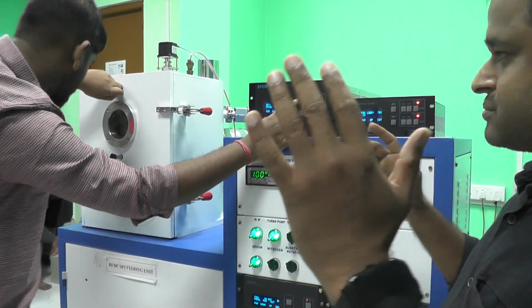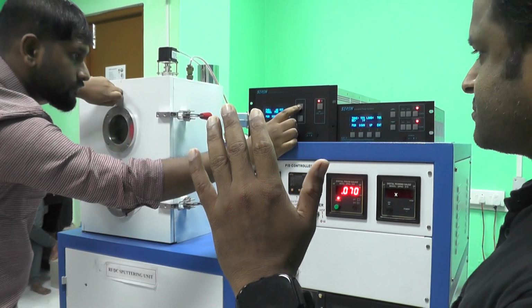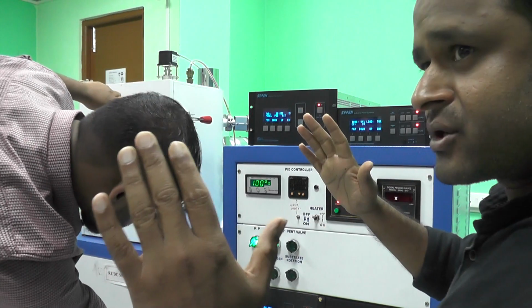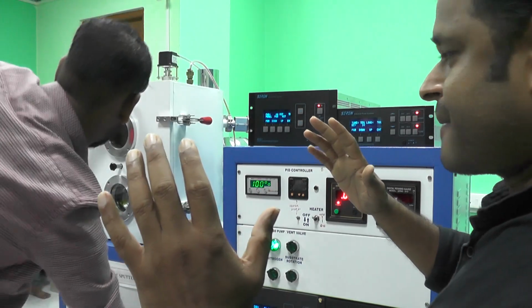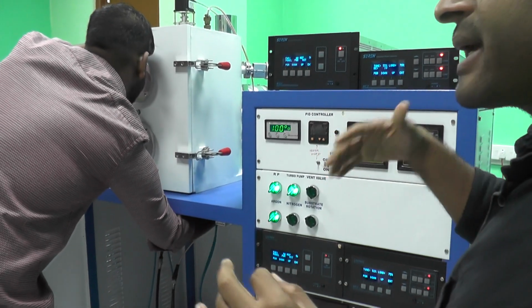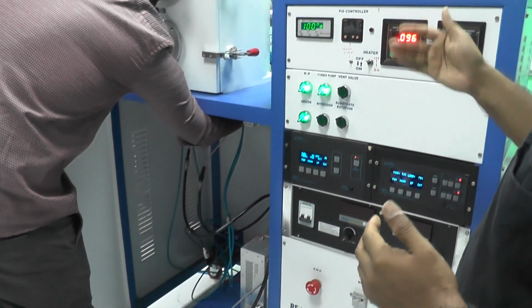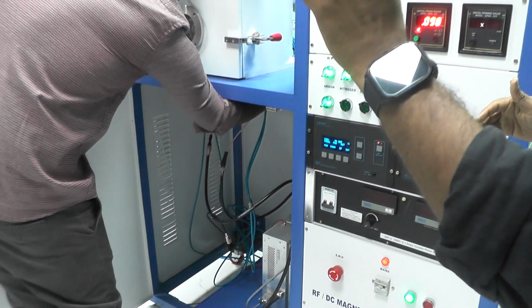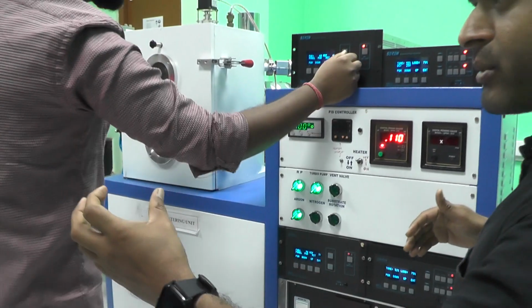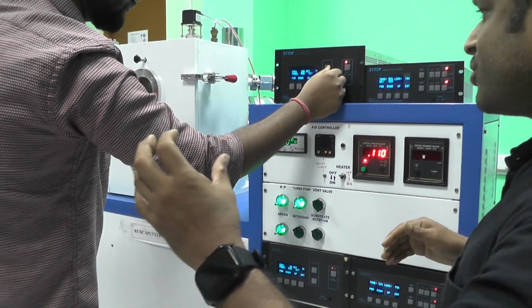For the superlattice kind of deposition, we are using two magnetrons at the same time. We have calibrated earlier how much time is required to grow a given nanometer of thickness.